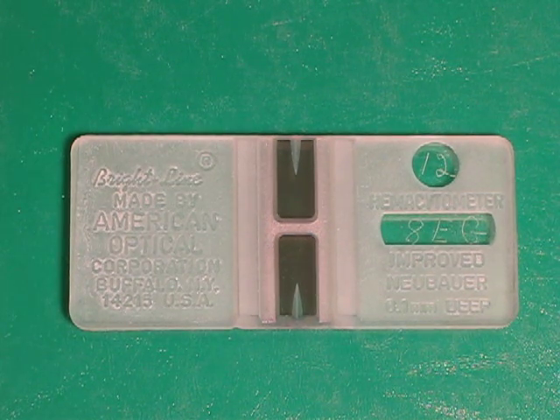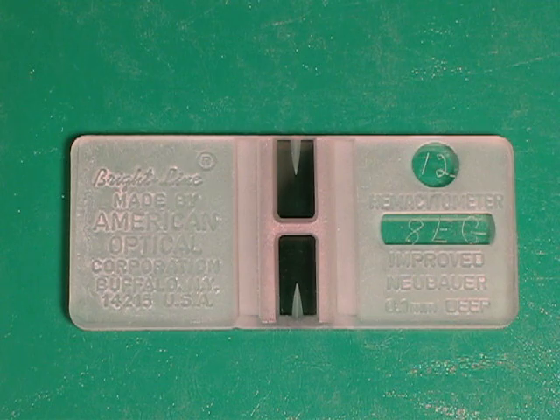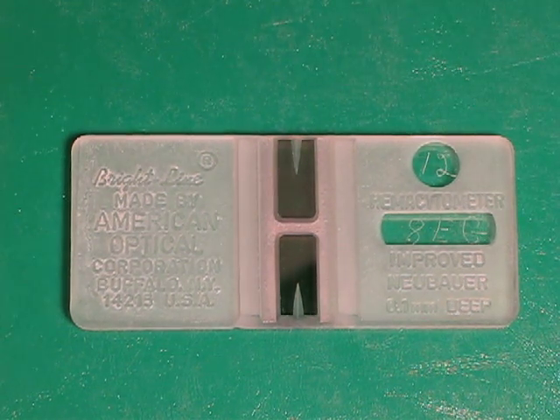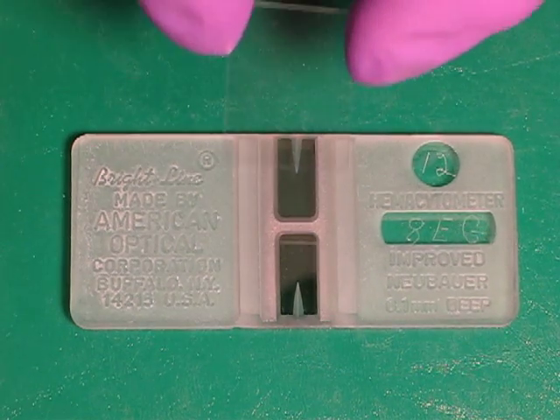Today we're going to be practicing loading a hemocytometer. I've already cleaned my hemocytometer with ethanol and dried it with a kim wipe. I've also cleaned the cover slip with ethanol.